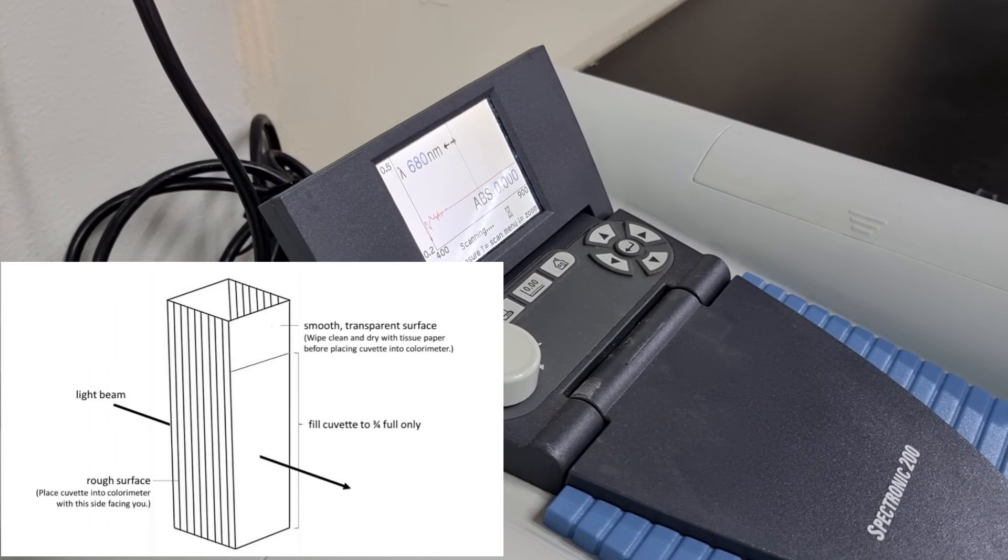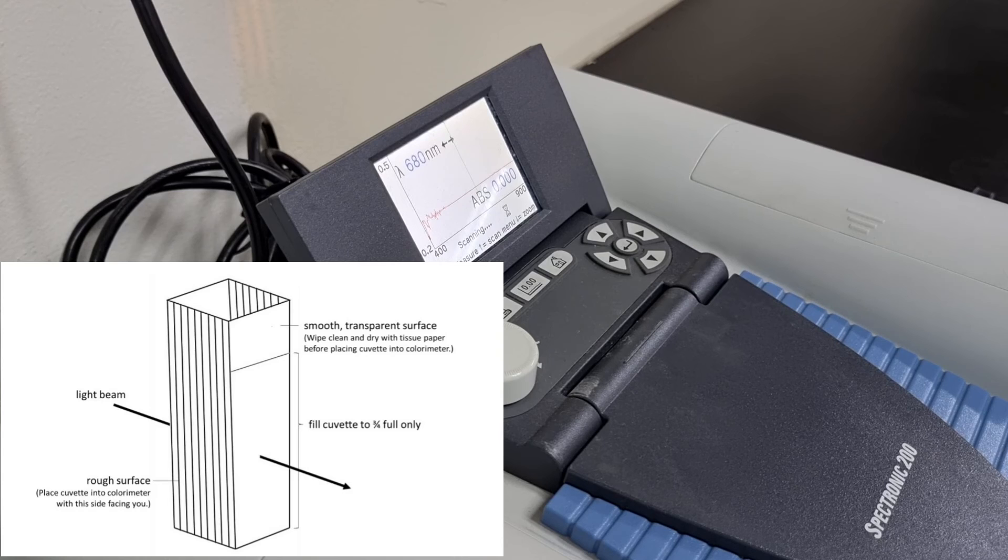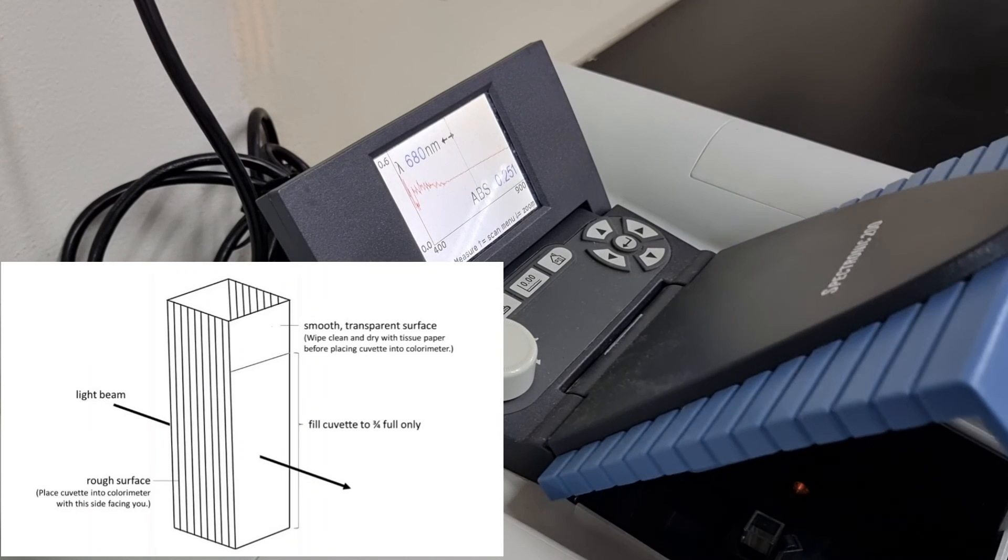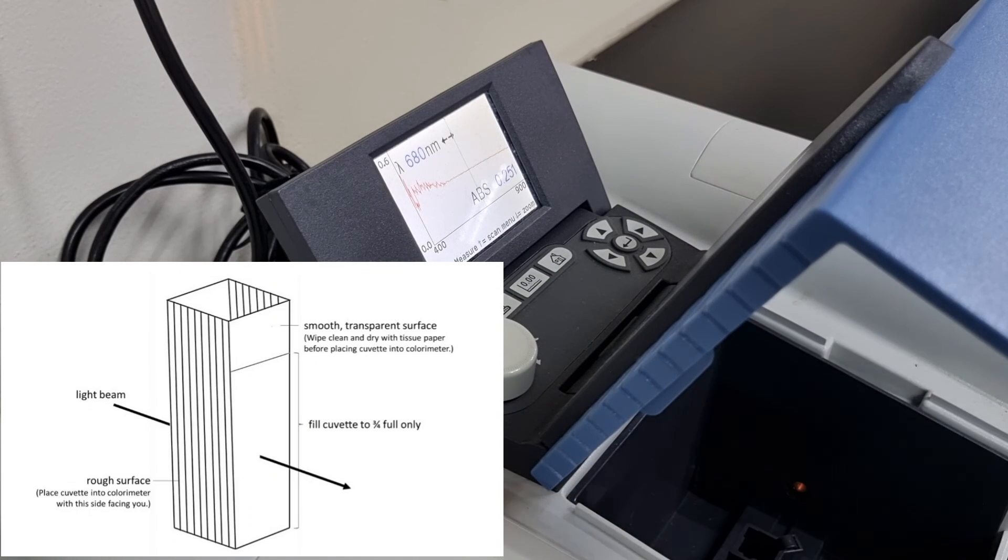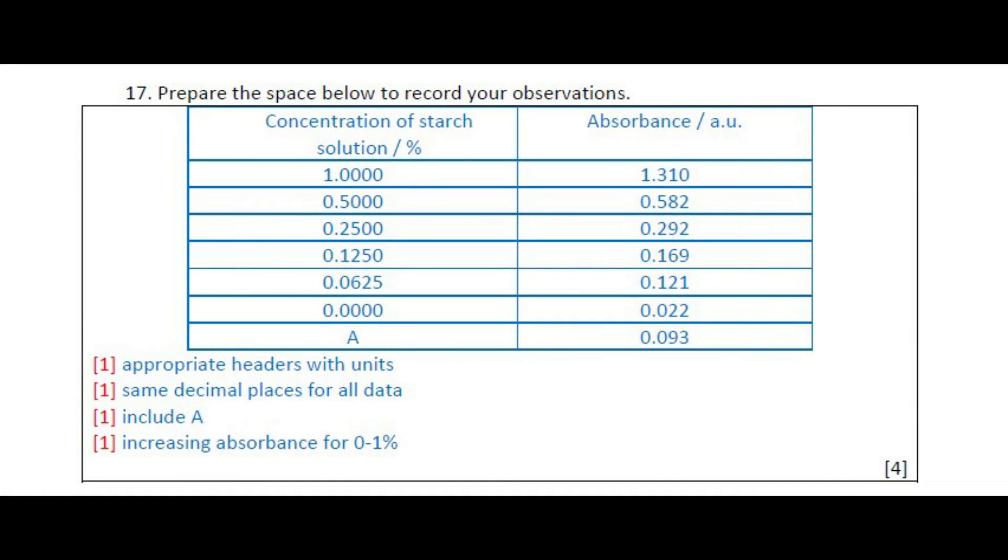Absorbance reading shows how much light is absorbed by the solution. So the higher the color intensity, the higher the absorbance should be. This is an example of the results you should be able to get. You can see here that the trend is there. Now other than that, for the previous table as well as this table, make sure that all your concentrations as well as the control, which is 0%, and the unknown is in the table.